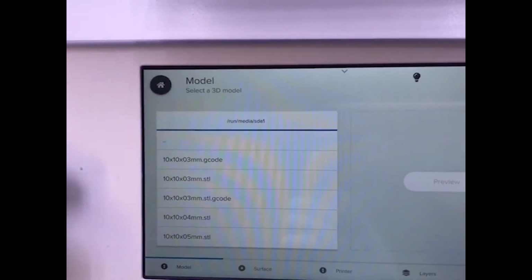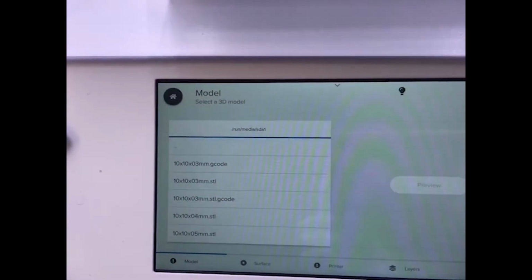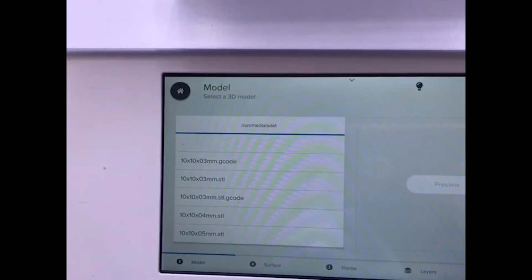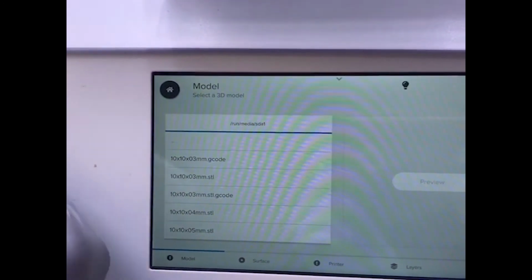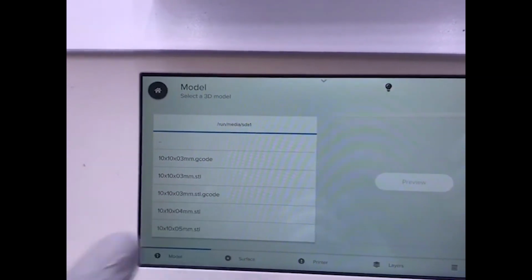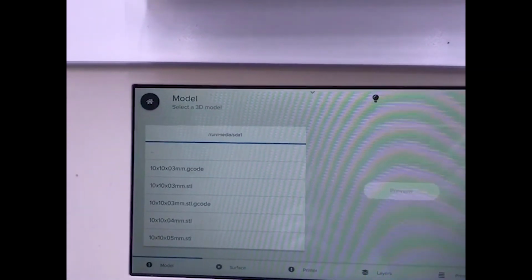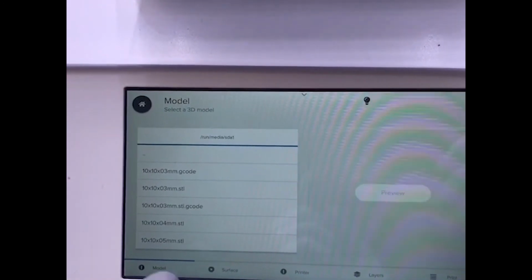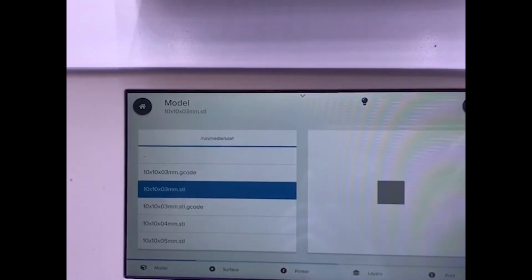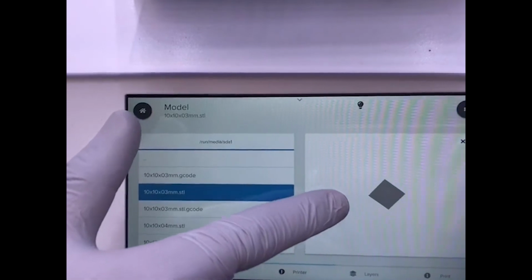Either the printer uses a special coding markup script called G-code, so you can basically code how you want it to look, or you can use an STL file, and the printer will convert it directly from the STL file into its own language and print it out. Here you can see this is just a regular square, and if we choose to preview it, you'll see that that's what it'll look like when it prints out.